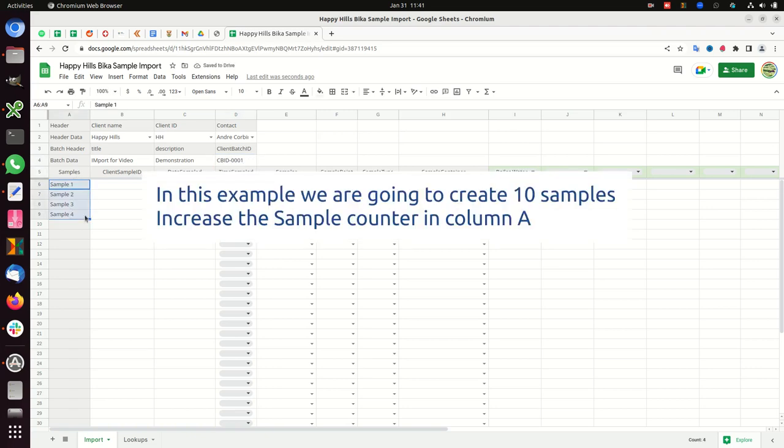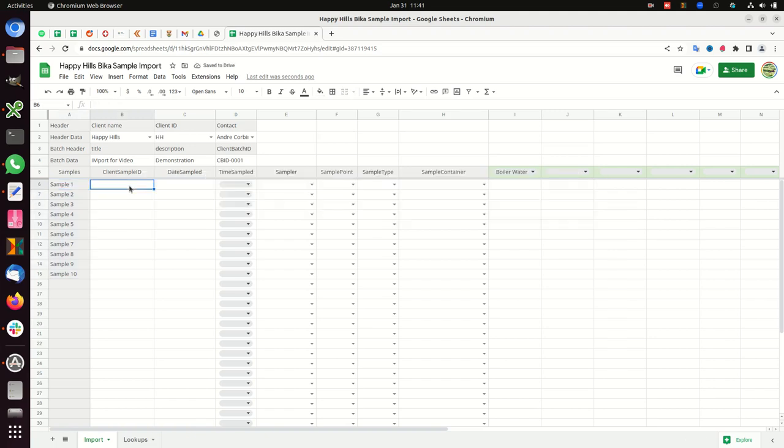In this example, we are going to create 10 samples. Increase the sample counter in column A, capture the client's sample IDs.